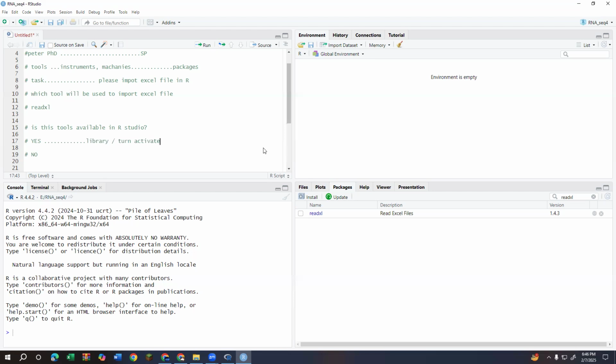You want to use your laptop, first you need to turn on your laptop. So all these packages are also like a machine. You need to turn them on. So for turning on, we will use the word library, because library is a word of our language. It means turn on or activate.